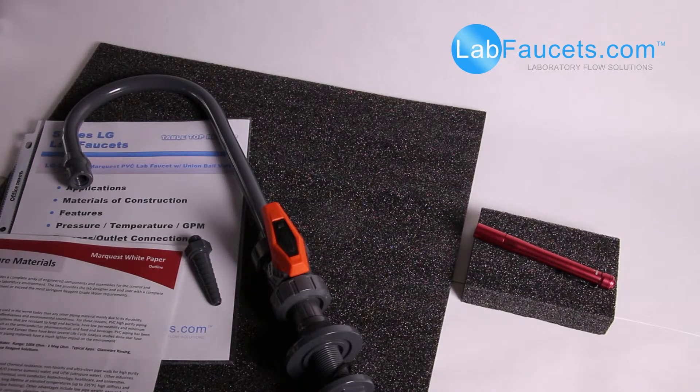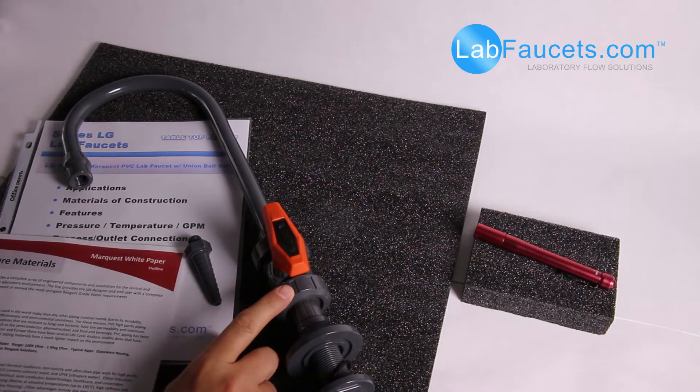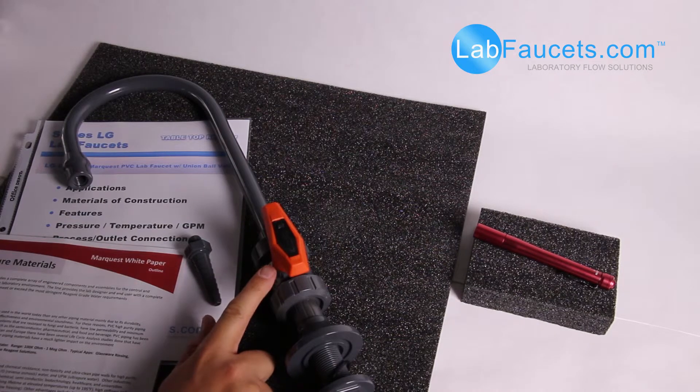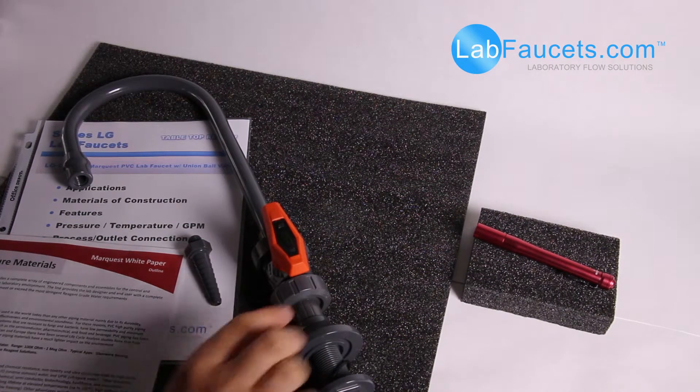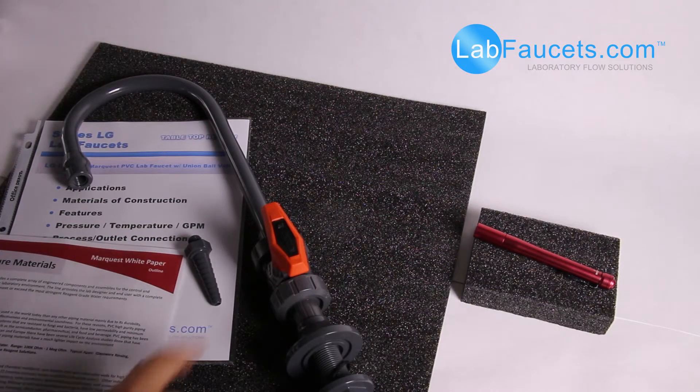Well that ends our LabFaucets.com tabletop review of the Marquest Scientific PVC lab faucet with a quarter turn rugged union ball valve, which also, just as a side note here, allows you to, if you ever do have an issue with the valve body, it can be replaced. As you see here, we have two union nuts and that body can be replaced.